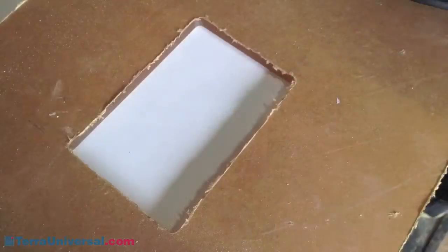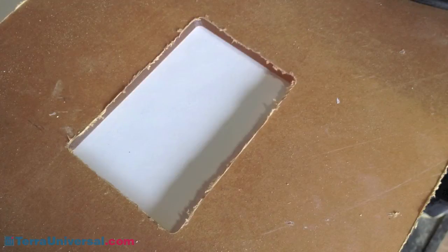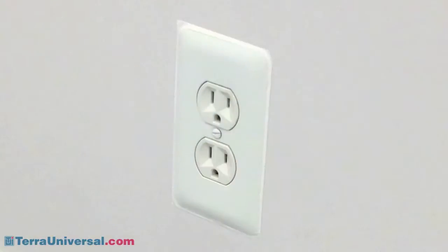Terra provides templates for standard modular clean room cuts, such as outlets, to aid in marking and cutting.